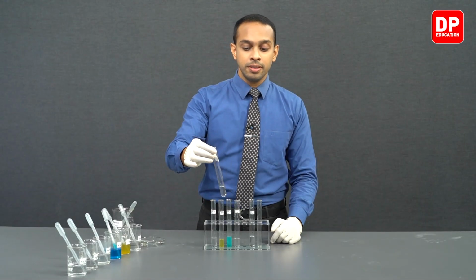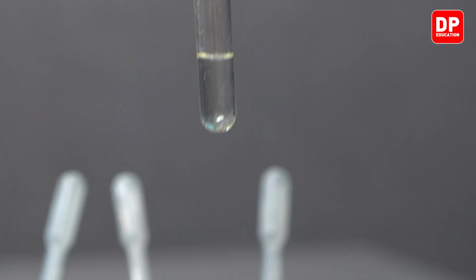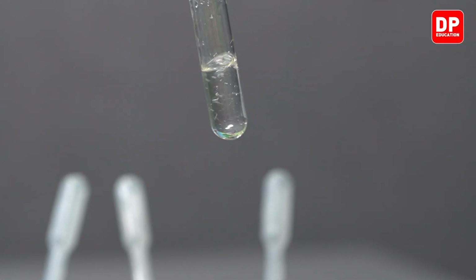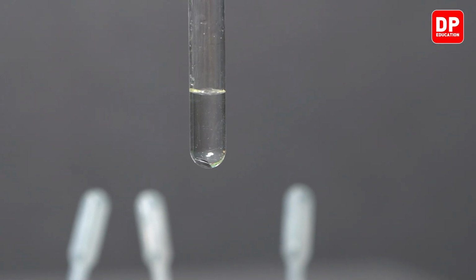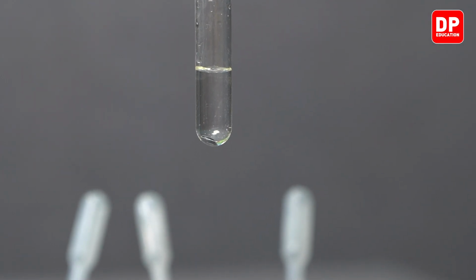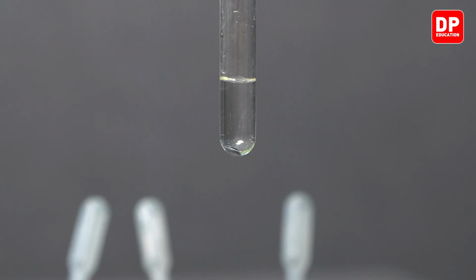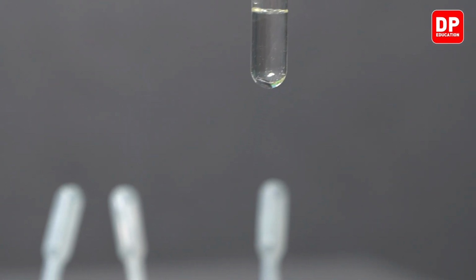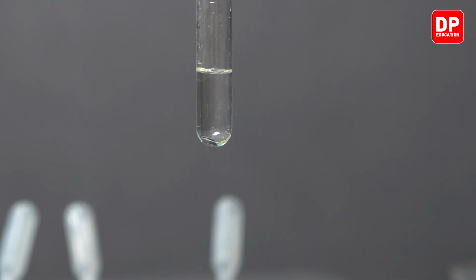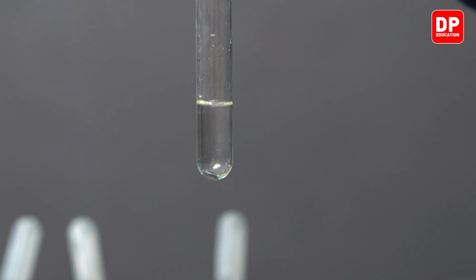And then we have lead metal added to magnesium 2 plus ion solution. No color change here and no precipitate is observed. This indicates that the lead metal did not react with magnesium 2 plus aqueous solution. So we can conclude that in this situation also, lead does not react or displace magnesium 2 plus ions into magnesium solid.